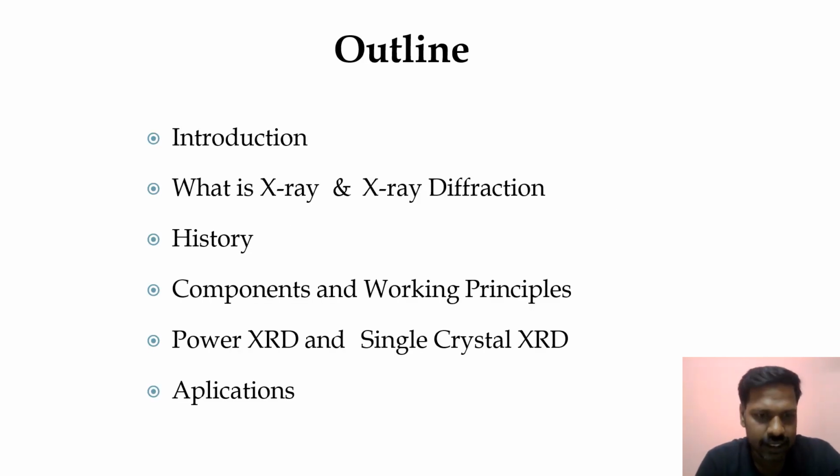Outline of this lecture. In this session, we will cover introduction to X-rays and XRD, history of X-ray diffraction, components and working principle, Bragg's law, powder XRD and single crystal XRD, and application of XRD. Let us start with the basics.